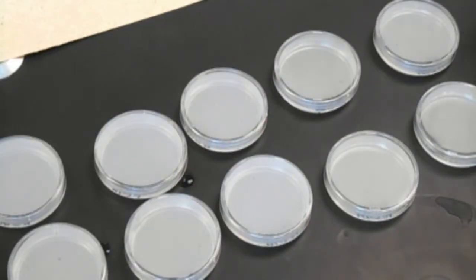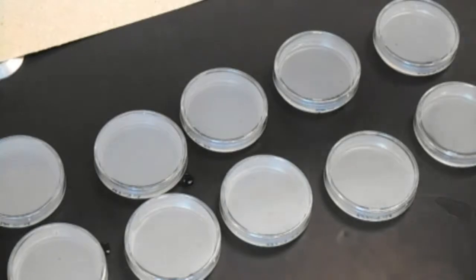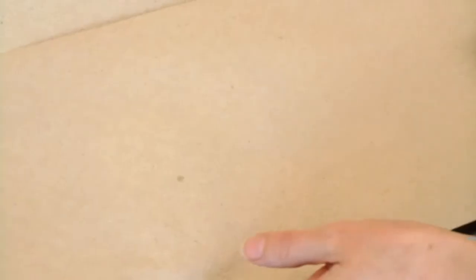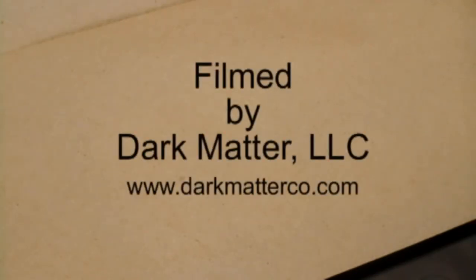Okay, so to finish this off, these are light sensitive. They need to cure for two days, and they should be in a dark spot, which clearly I don't have right here at my lab bench. So I am simply covering them with some paper towels. Hopefully that'll be dark enough, and our plates will set. As soon as the worms come in, they will be ready to be plated, and that's really all there is to it. So, I hope everyone found this helpful, and please give this kit a shot. It is not as intimidating as it may look at first. Thanks!